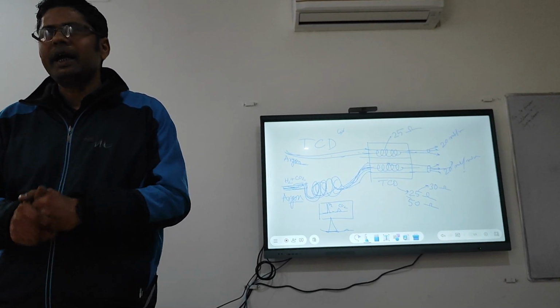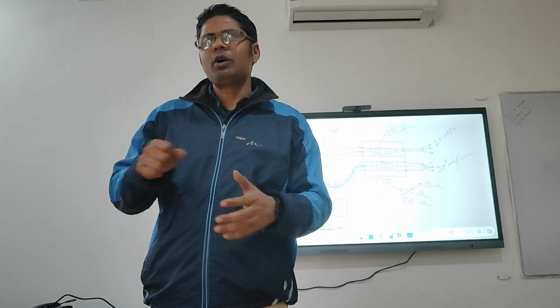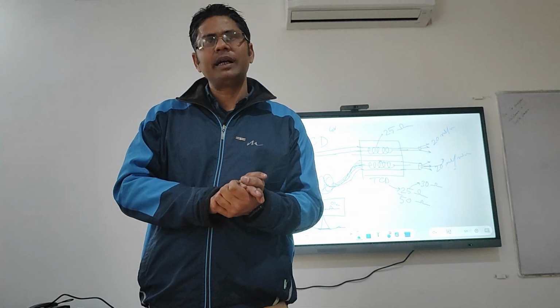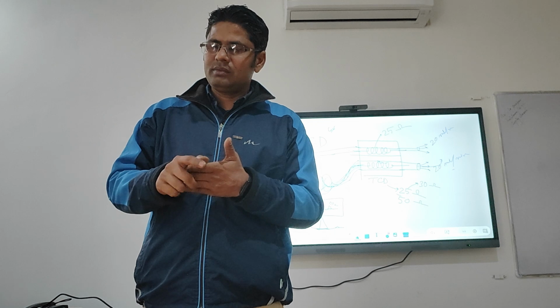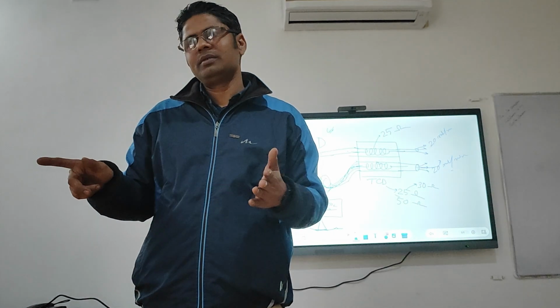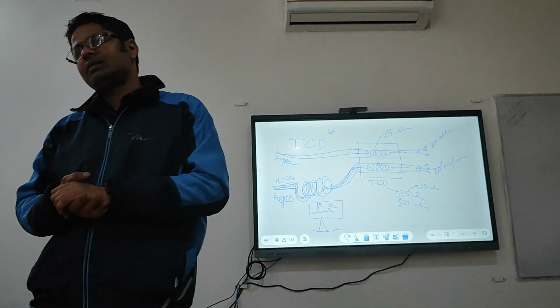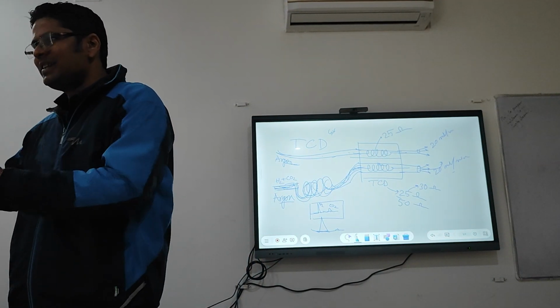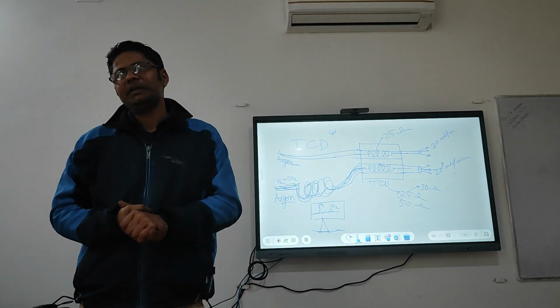No way. In that case, you have to inject your sample in a larger volume, so that you will get a detectable peak. So you have to inject a large volume in TCD.